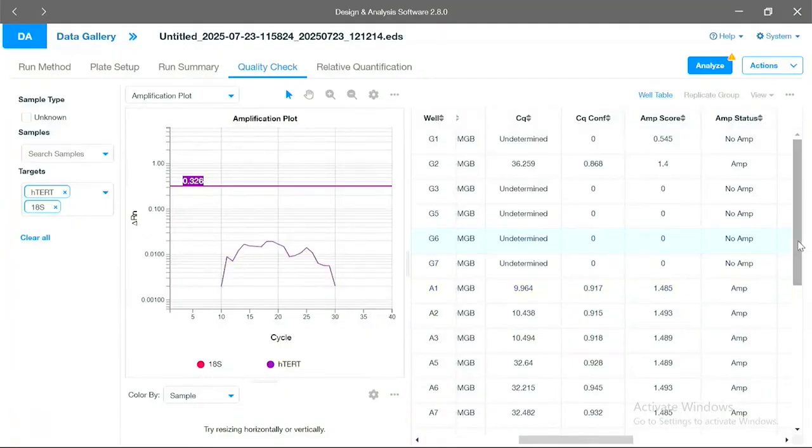All right, so anything between 0.8 and 0.6, I would put in that marginal range and say, let's look really hard at this. Look at technical replicates, look at the shape and consistency of the assay as a whole, and move from there. This is all about what data you want to put into your analysis. Doesn't really matter my opinions.